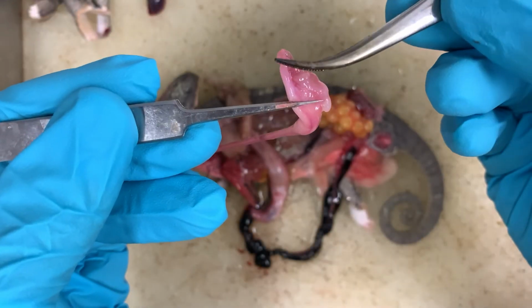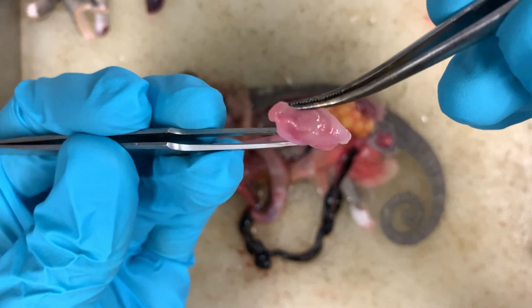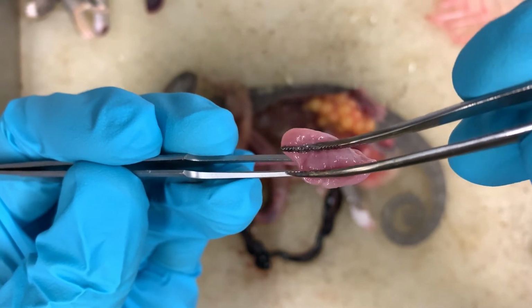The tip of the tongue is thick and muscular. It has, at its distalmost end, a fleshy and sticky pad, which engulfs prey items and sticks to them, to then draw them back into the mouth.